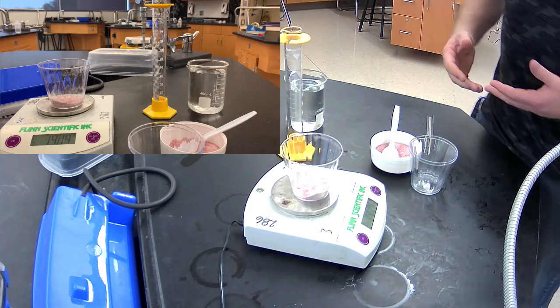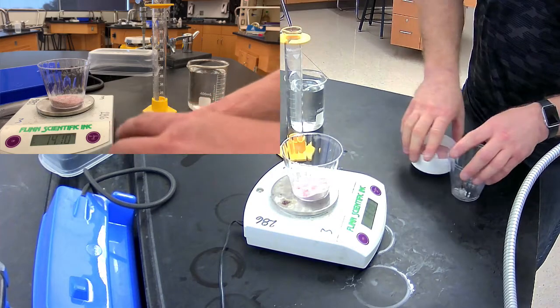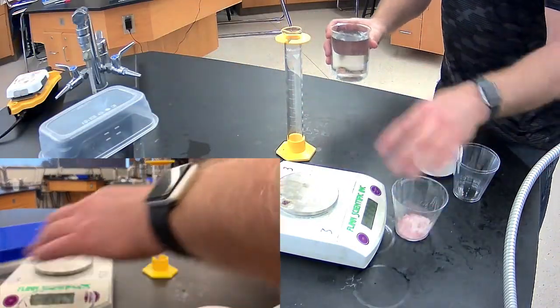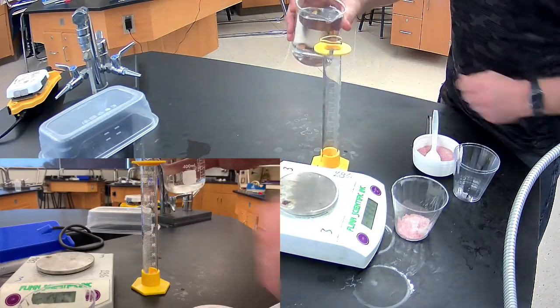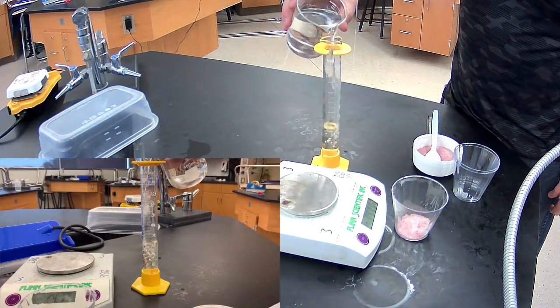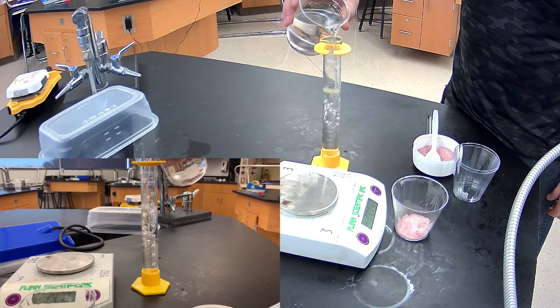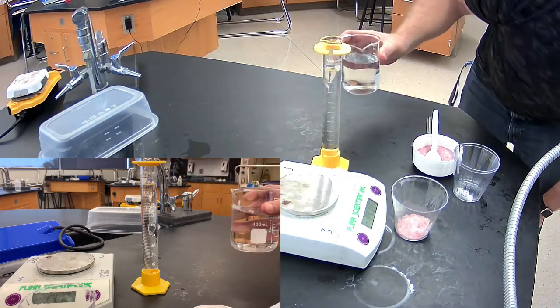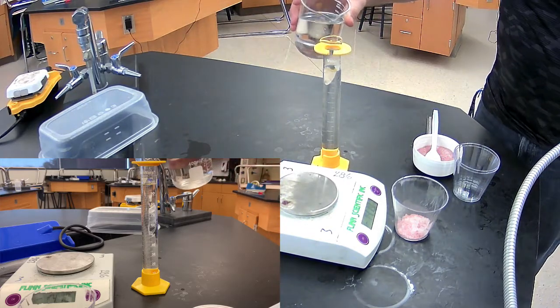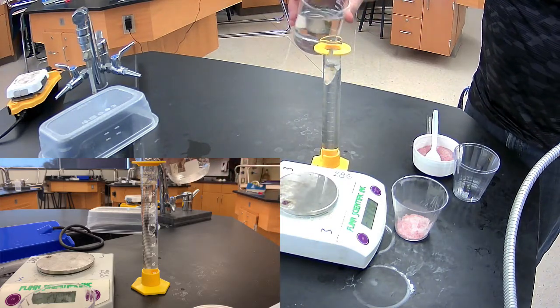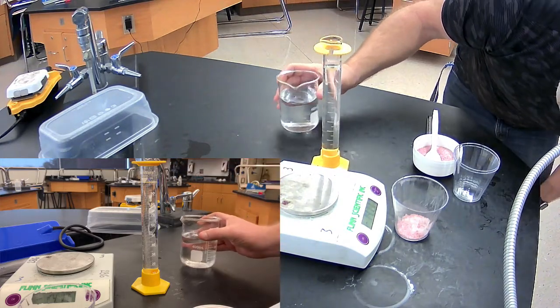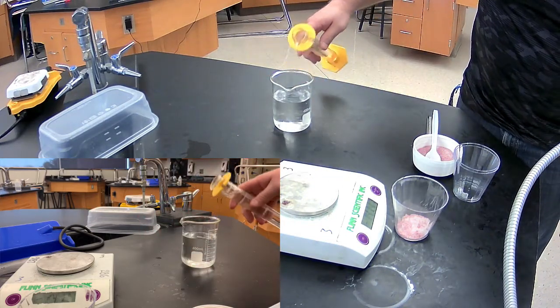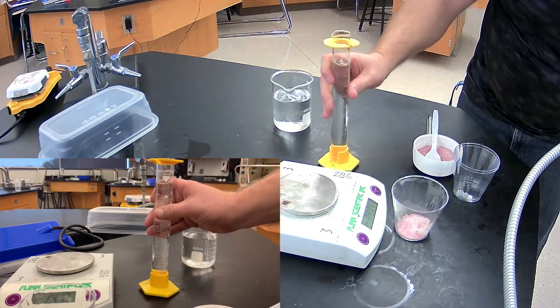And then now I'm going to add that to 100 milliliters of water. So we'll leave that out of the way and we're going to get 100 milliliters of water to that. And again, measuring from the bottom of the meniscus, that looks a little bit high. Looks really good.